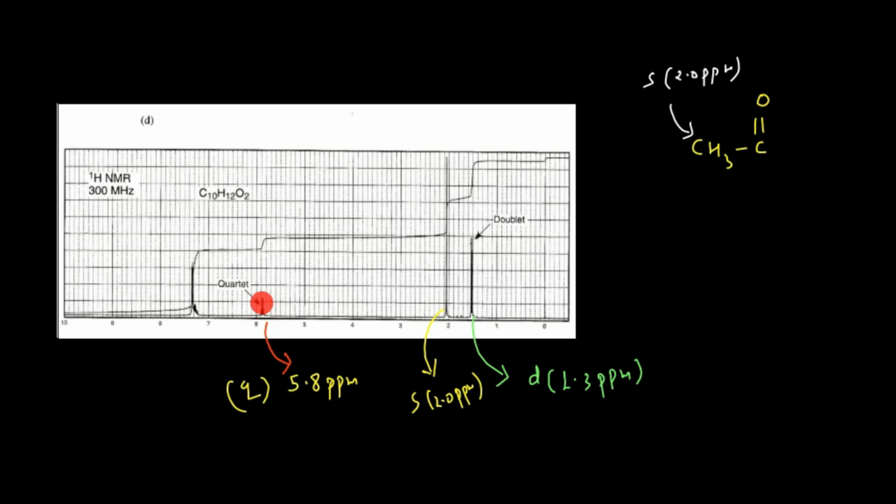That means the integration is very low, so the number of hydrogens is very low. There may be a methine kind of hydrogen, that is, only one hydrogen may be present. Now what I can do is put my CH here, and connect my CH with the oxygen, there is no problem in that. And again I'll have the anisotropy due to this particular phenyl group.